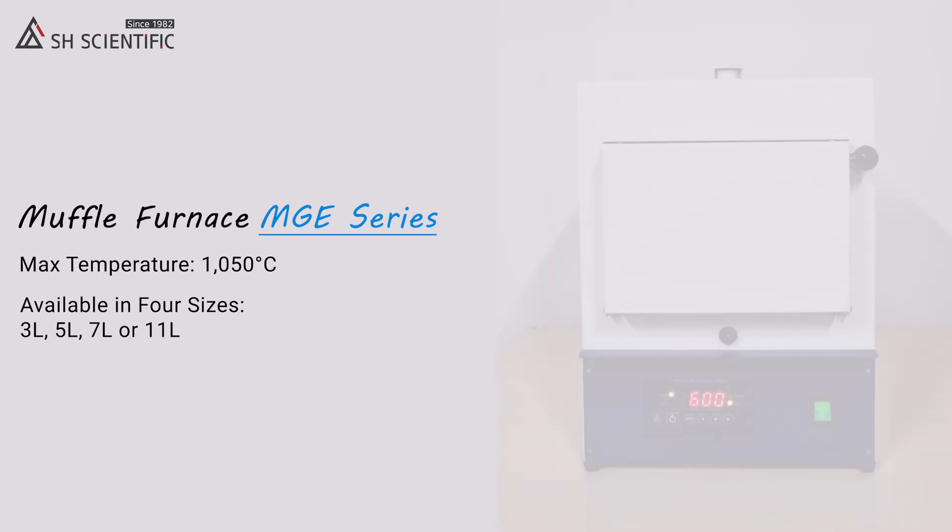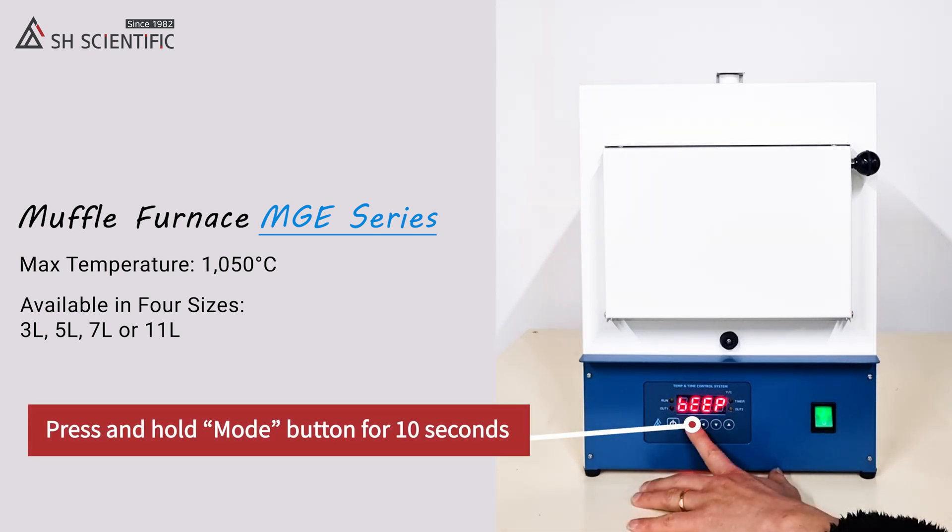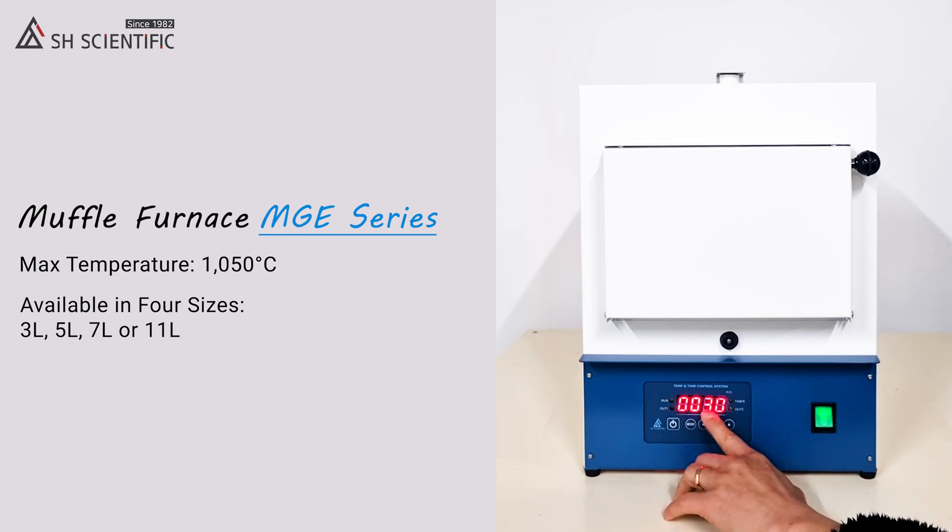By the way, you'll hear a beep like this when the time is up. Here's how to set the duration of that beep. All the digits here are seconds — not hours, nor minutes.